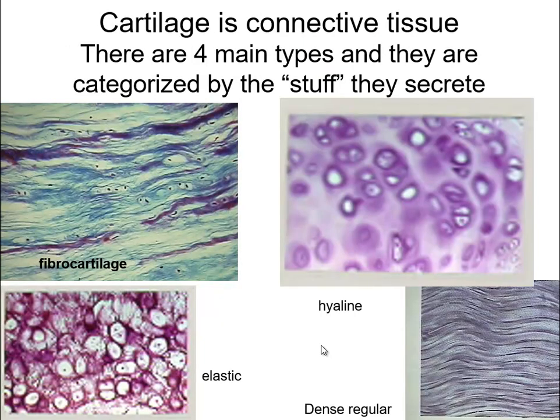Some other tissue you'll be responsible for in lab is dense, regular connective tissue. The bottom right shows dense, regular — it won't be red like smooth muscle would be. To me it looks like strapping tape: if you've seen scotch tape with strings in it, that's what this tissue looks like. They call it dense, regular, and this is where you really need strength — so your tendons, your ligaments, anywhere you need really strong connective tissue, you can lay down dense, regular tissue.